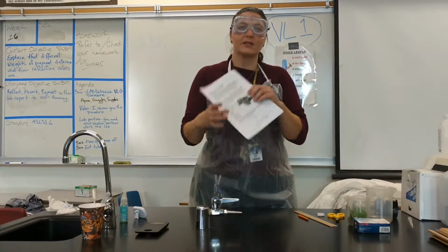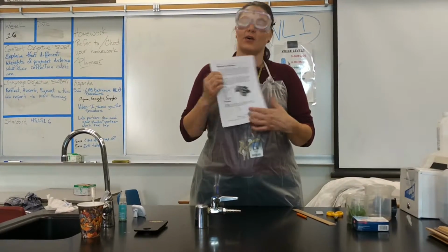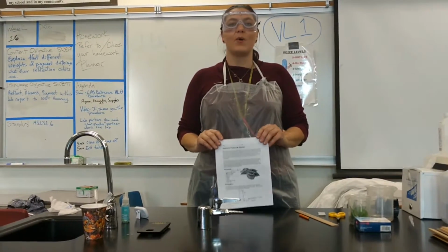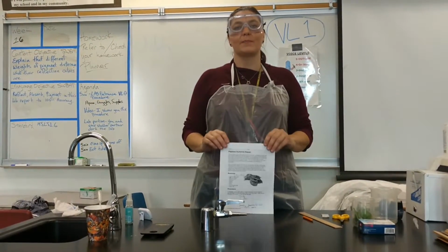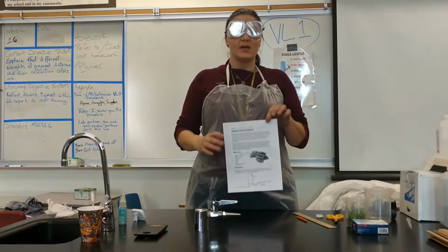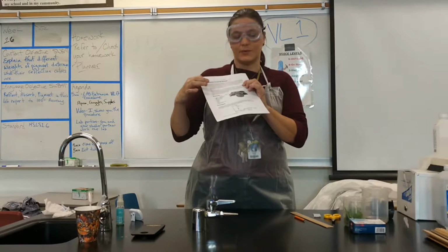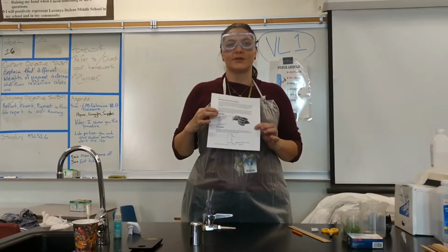All right, I have my checklist right here. It is with the handout called Pigment Powered Plants, because today we're learning about why different pigments power our plants. What's so special about it? So you've already read the preface, which is why are we doing this? Now we're going to check on the materials.